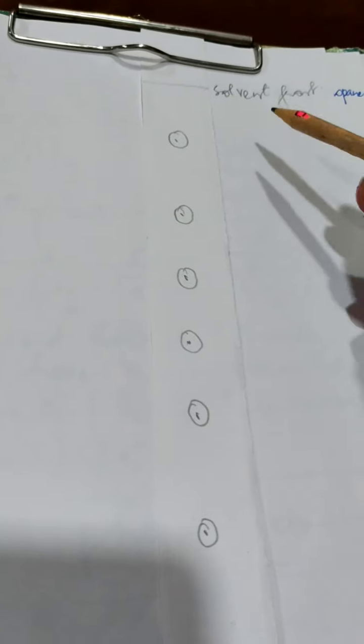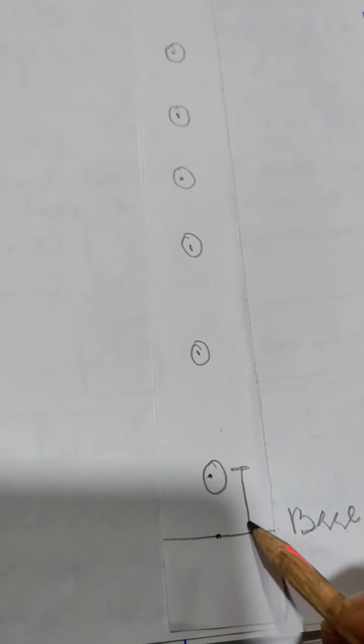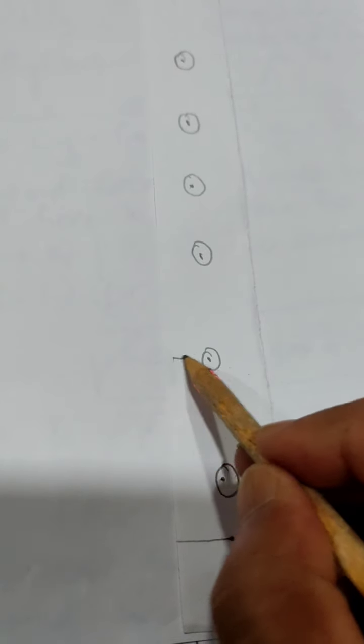So now you have the solvent front and you have the baseline. You simply take out the ruler and see what distance is between this spot and the baseline, this spot and the baseline. All these spots have different distances from the baseline.